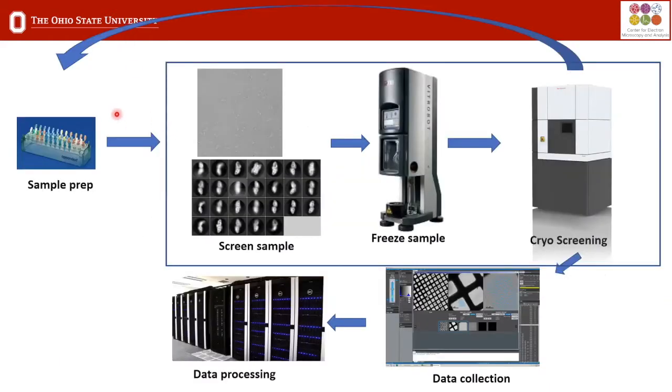So for those of you not familiar with the cryo-EM workflow, here it is. You start off with your sample prep. Your goal is to have as pure a sample as you possibly can get. Once you think you've got everything figured out, then comes the screening process, and this usually takes a few rounds to get all the conditions nailed down just right.